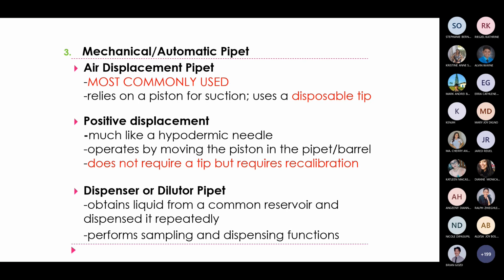Okay, the second one, positive displacement. It is much like a hypodermic needle. So we have pictures of that.